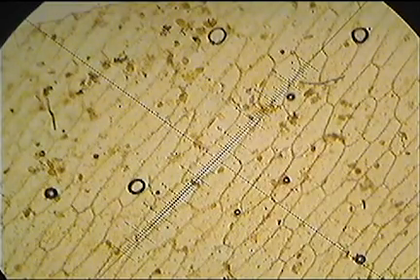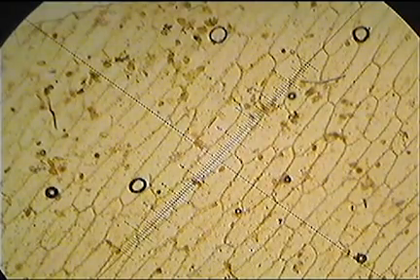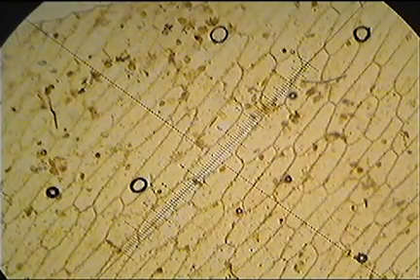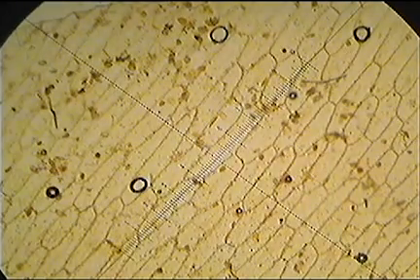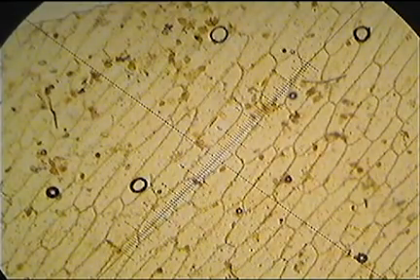Now moving it to look at another cell. Looking at the cell just to the left of the center underneath the scale, this one's only 2.5 units across. So we could take our value, 0.099, and multiply that by 2.5 eyepiece graticule units, and that would give us, rounded, 0.25 millimeters across.